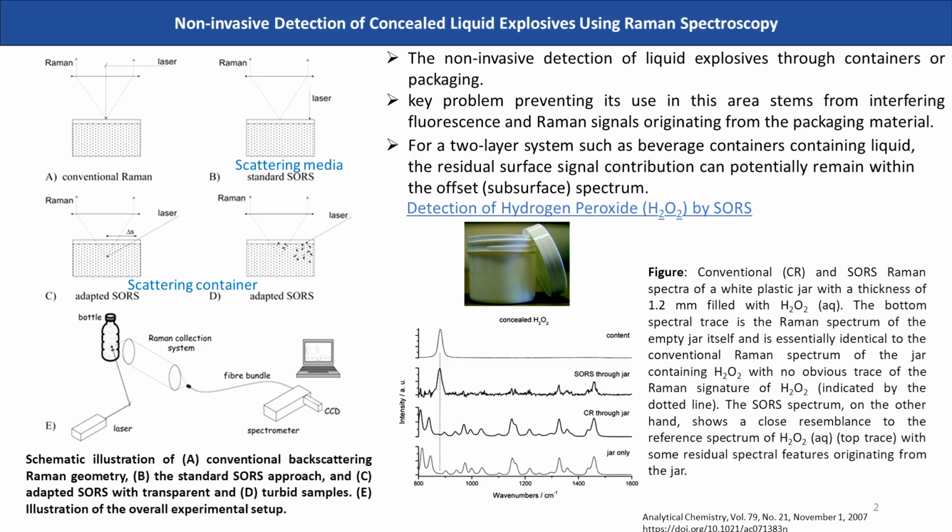So there is a phrase here, non-invasive detection. Non-invasive detection of concealed liquid explosive. It means you do not open the bag. So an explosive, which is liquid, is hidden in some packet, and without opening the bag, you can identify whether the liquid is of a particular nature or not.